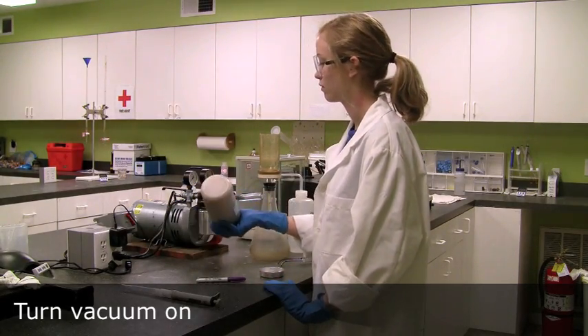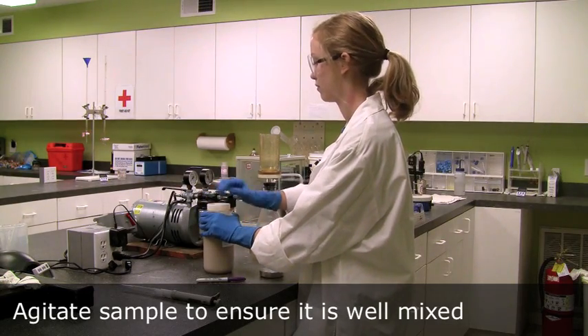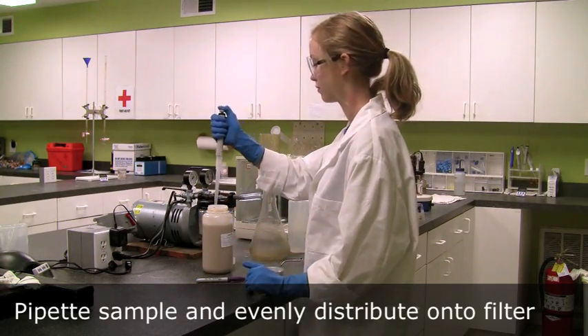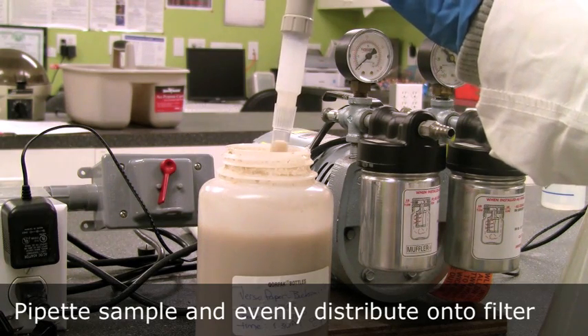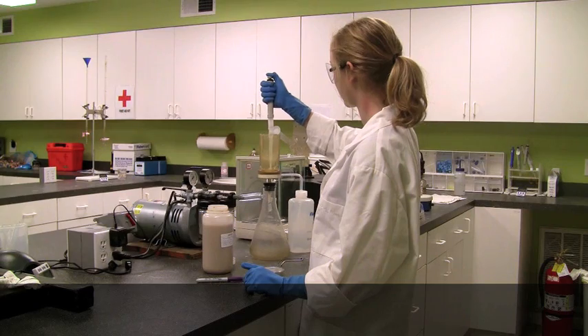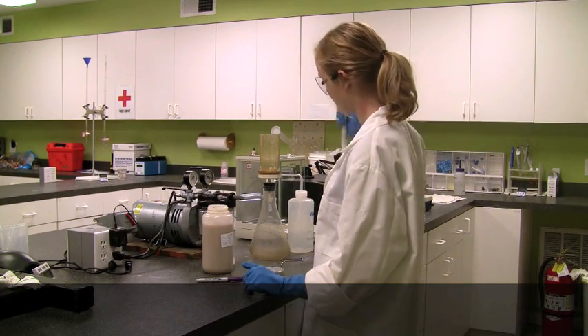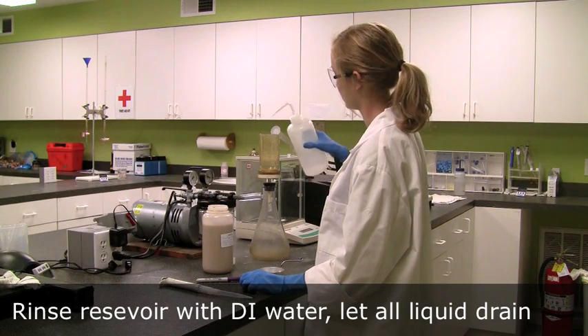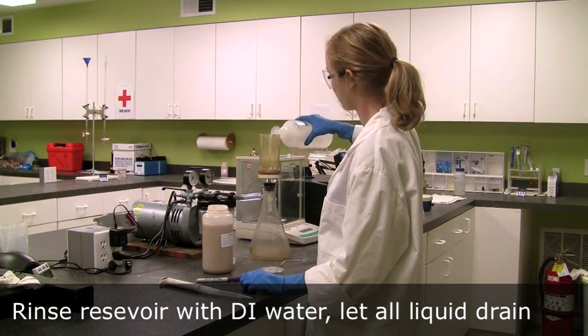Turn the vacuum on, agitate the sample, and remove the desired amount. A pipette, a syringe, or a graduated cylinder can be used. Distribute the sample evenly on the filter. Then rinse the reservoir with DI water to ensure that all the sample is filtered.